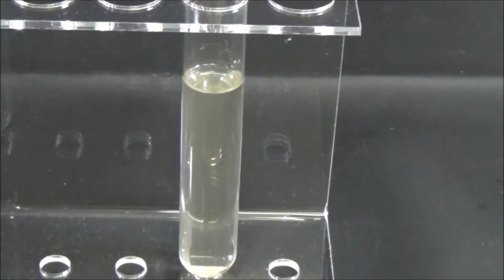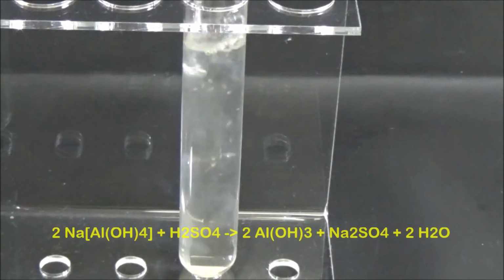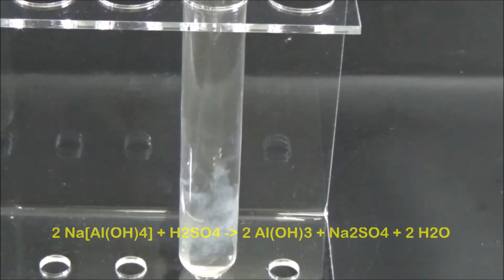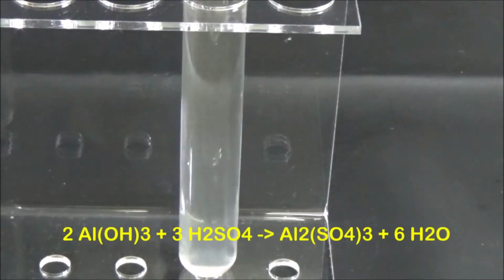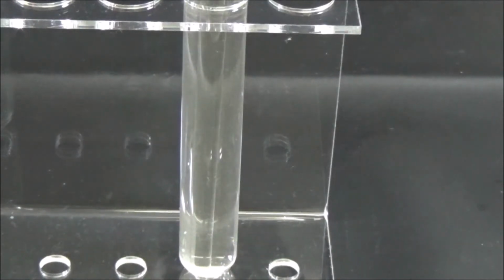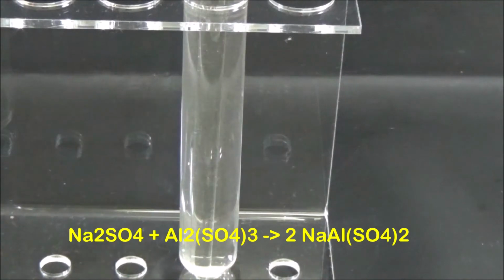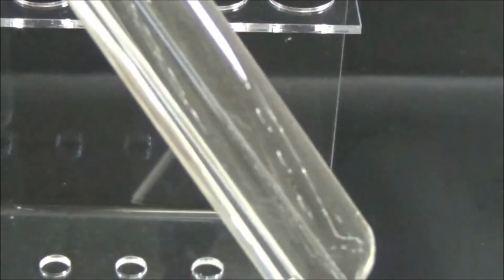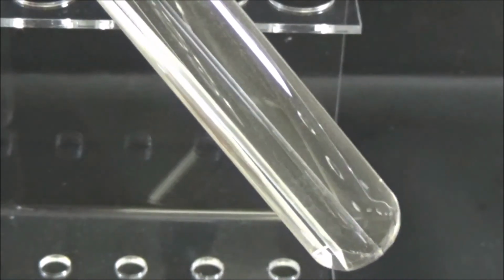If dilute sulfuric acid is now added to the sodium aluminate solution, a white precipitate of aluminum hydroxide initially forms, which redissolves to form aluminum sulfate when further acid is added. With the alkali metal sulfate that is also formed, the aluminum sulfate crystallizes out to form double salts containing water of crystallization, the so-called aluminum alums.